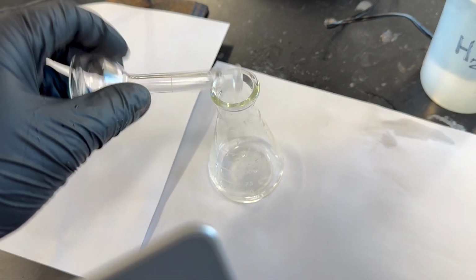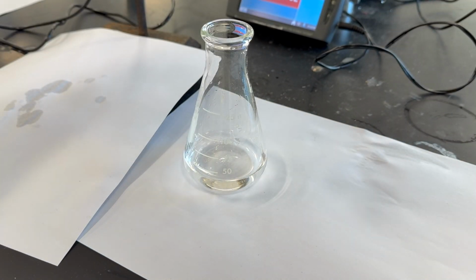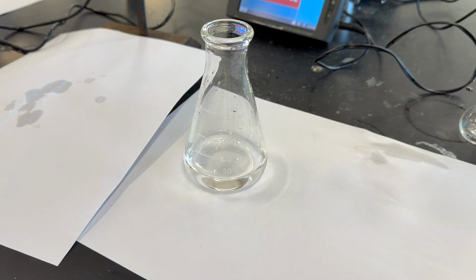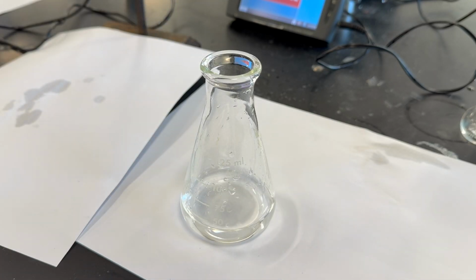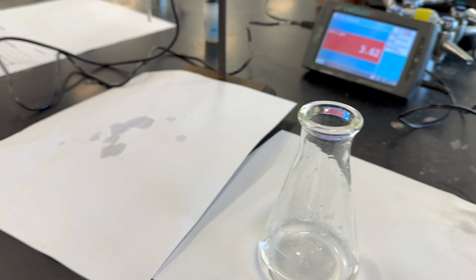We're going to rinse the flask with some water. Make sure that we have all of the vinegar in there. Again, the added water does not affect the number of moles of acetic acid. We're gonna add a couple drops of phenolphthalein. And this time around, we are not going to measure the pH. We're just relying on the indicator.